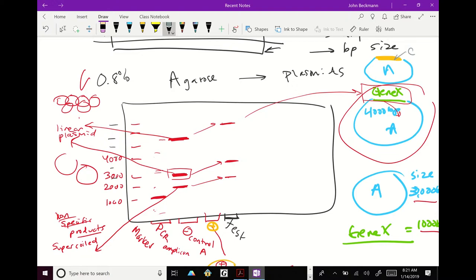Okay. So in that case, your positive control is going to be even higher than your experiment. But what you're controlling for here is basically an upshift in the DNA. So basically the comparison is, compared to your negative control, your positive control is going to have this upshift effect, right? So you're kind of controlling for basically just a difference that you can measure visually.